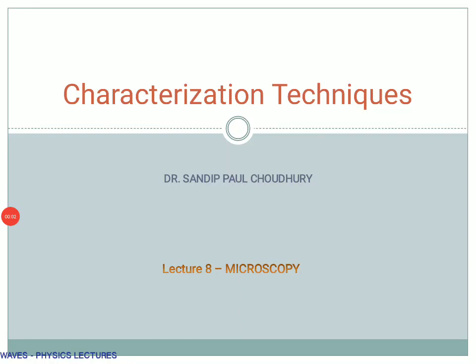So we are going to start with the eighth lecture of characterization technique. Till now we have studied one technique in detail, that is the X-ray diffraction technique. We have also looked into the instrumentation part. Obviously that's not a complete course in itself, because in X-ray you need to learn a lot of additional things.